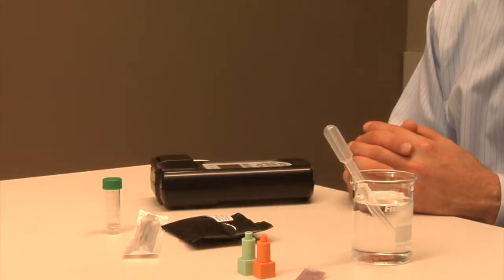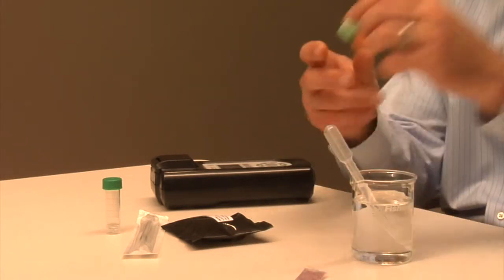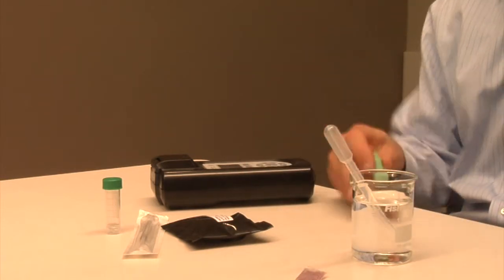For your convenience, the sensor buffer caps and fluorimeter screens have been color-coded for each metal. Lead is green, uranium is orange. As part of this test will be time-sensitive, we will first prepare the required materials. An ANDalyze Fluorimeter. 1 lead or uranium sensor bag. 1 1 milliliter syringe. 1 lead or uranium buffer solution, 1 transfer pipette, and 1 sample cup.